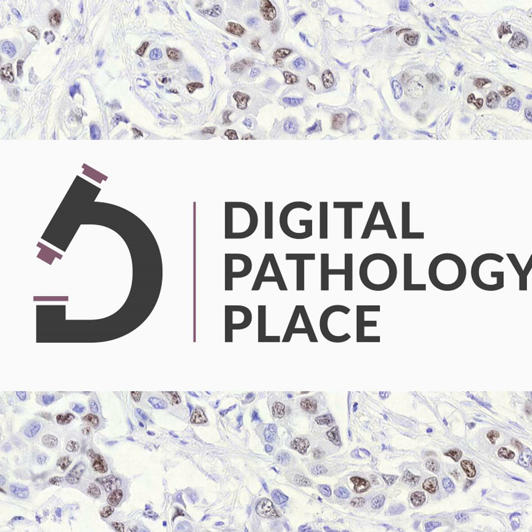So that's one way of changing the workflow for the pathologist a lot, and we don't want their reporting to go backwards and be more difficult, because there are all these additional systems that aren't in their LIS, or they may not be plugged into their LIS or their IMS, but we can still work with those companies to directly pull that data into the report, right? And also working with companies like Path Presenter, who hopefully provide a middle layer there to make lives a little easier. But even if there isn't an IMS that's capable of pulling in AI results, we can work with those vendors directly. So that is changing their workflow already, today.